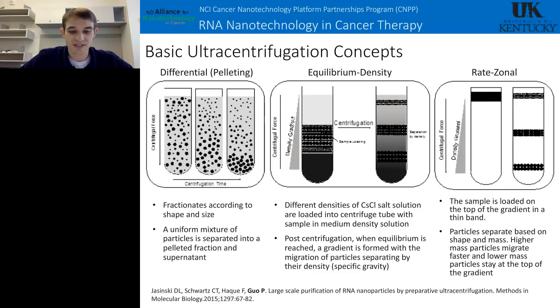Then there are equilibrium density gradients. This is used to separate particles by their density, which works very well for RNA because it's much more dense than proteins and even more than DNA. So after you do your in vitro transcription, all you do is load your sample in, and because of RNA's high density, it will separate to the bottom and you can get a pure product. This works by you put your sample in, and as you centrifuge your sample, the gradient forms and your particles migrate based on their density.